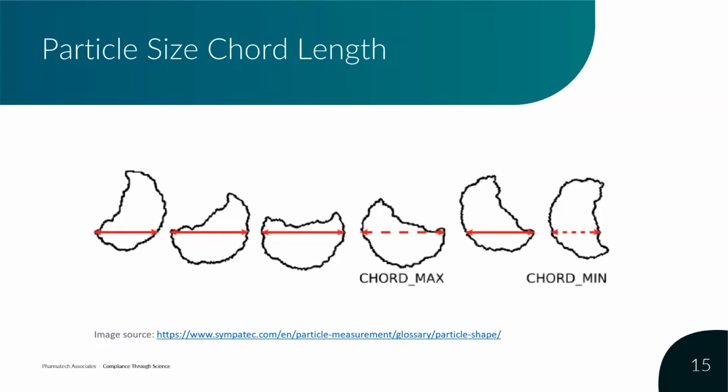Also, porosity of the tablet. Porosity measurements have been shown to be very helpful for developing a model for dissolution real-time release testing. Several products have been approved that use this modeling instead of relying on manual dissolution testing. I'm pretty sure, I believe all of these products have been immediate release, but research is continually progressing in this area.